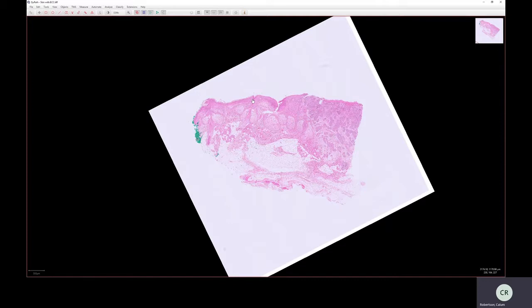After that, there are a number of processing stages which culminate in a tissue section which has been fixed and then embedded in wax. So it's paraffin embedded. And after that, a tiny slither of tissue, 4 microns thick, is cut.